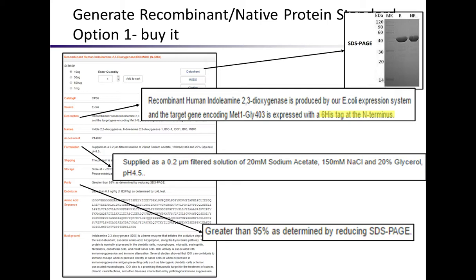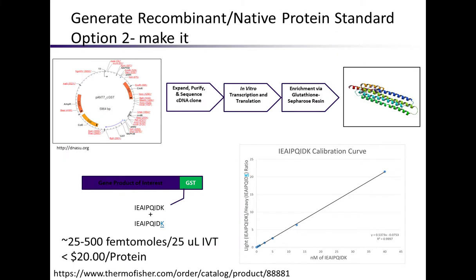Okay, so we're in sodium acetate, sodium chloride, and glycerol. So this is really important because some stuff, such as glycerol, makes it really hard to do an amino acid analysis. Glycerol is a huge interferent there. And so if we wanted to sequence the protein ourselves or do an amino acid analysis of some sort, we might have some trouble with this one specifically and might have to figure out a way to get rid of that glycerol. But it's good to know about.